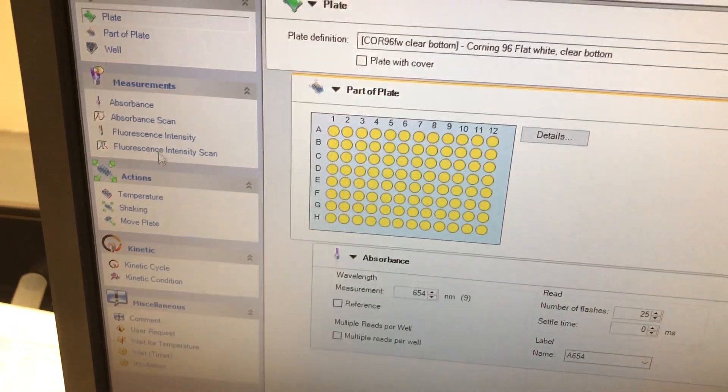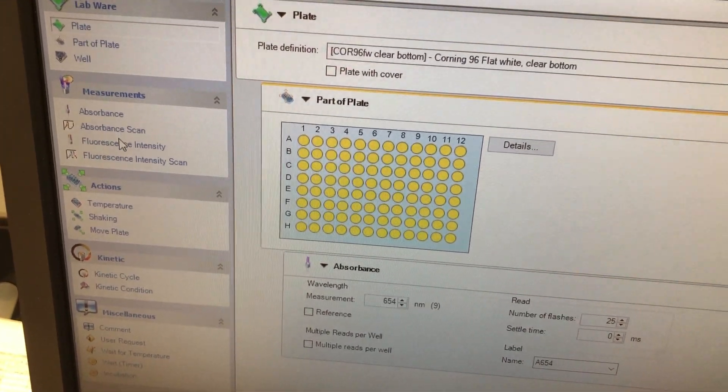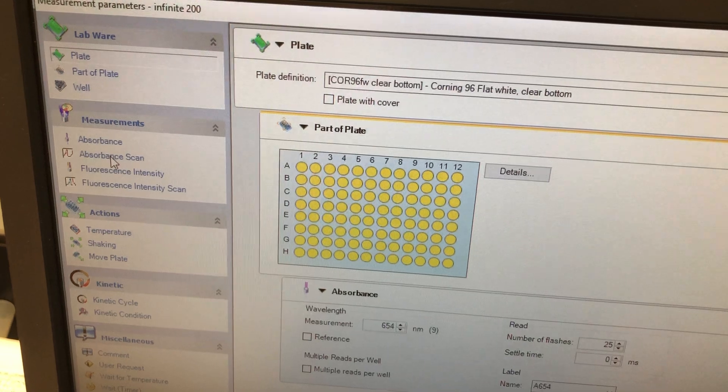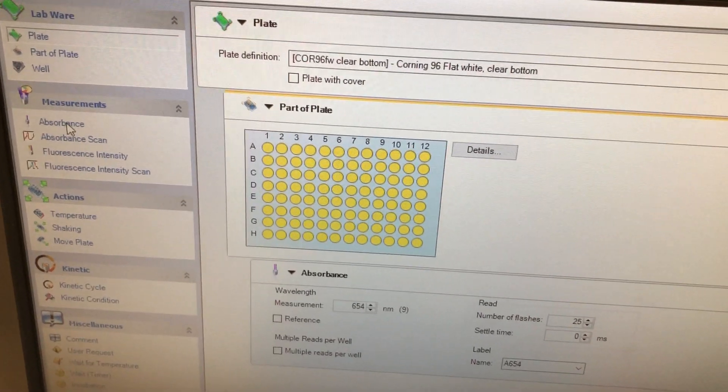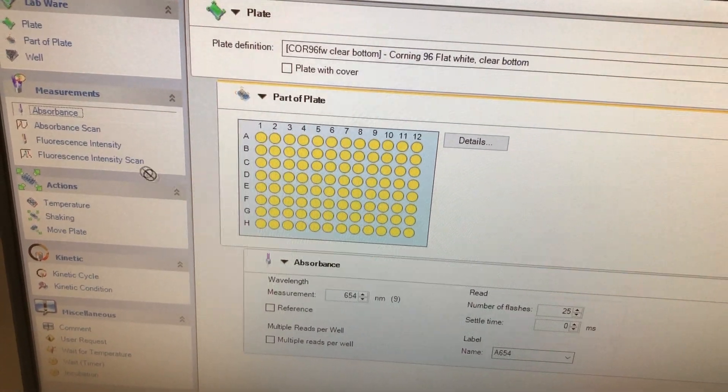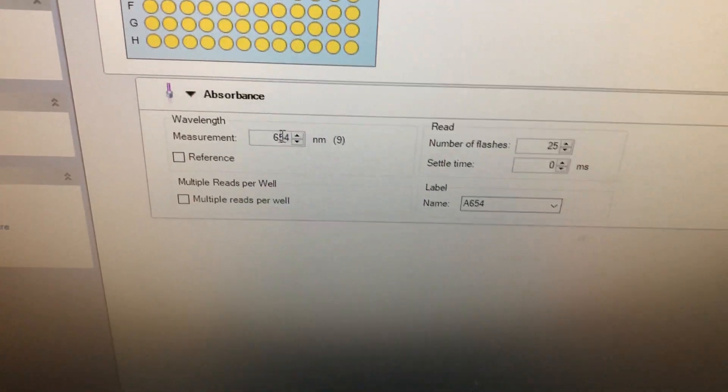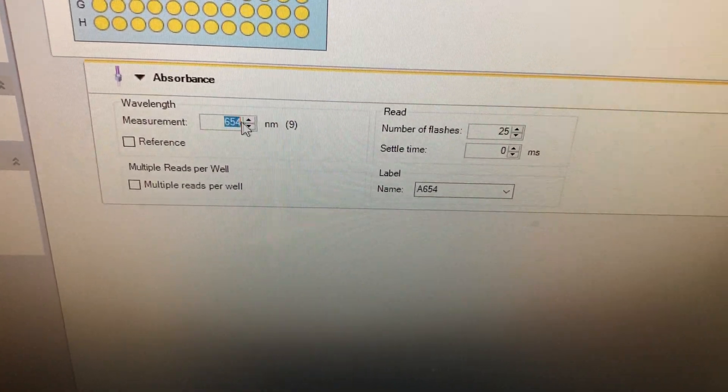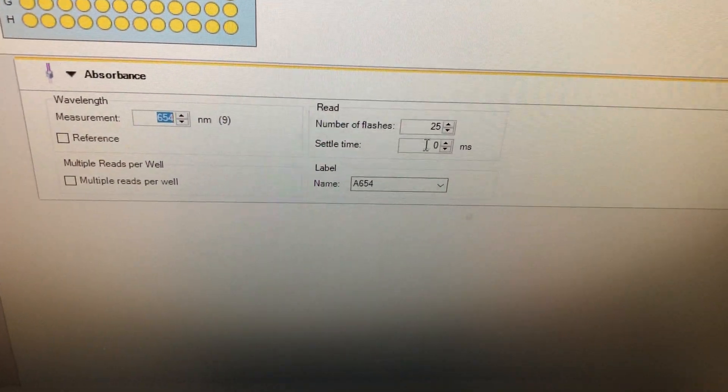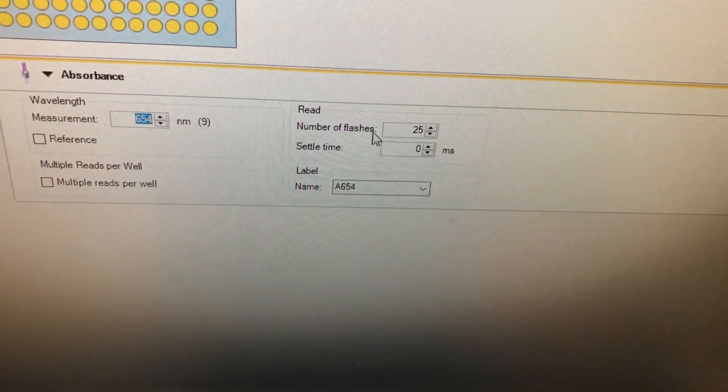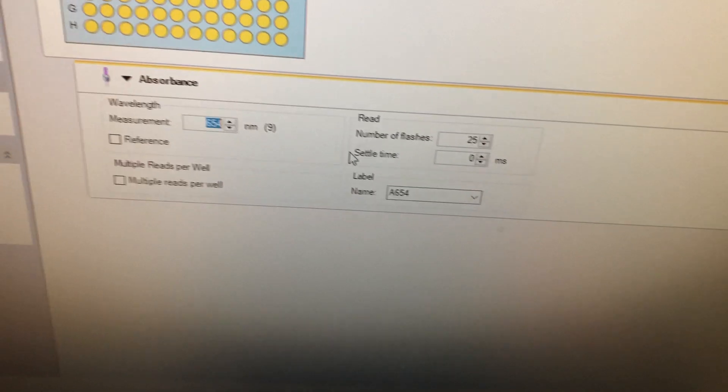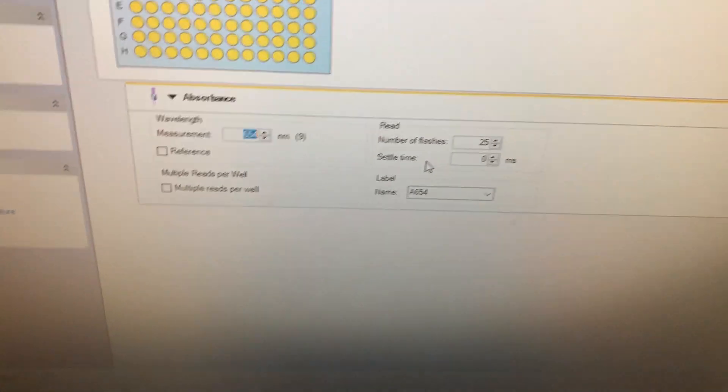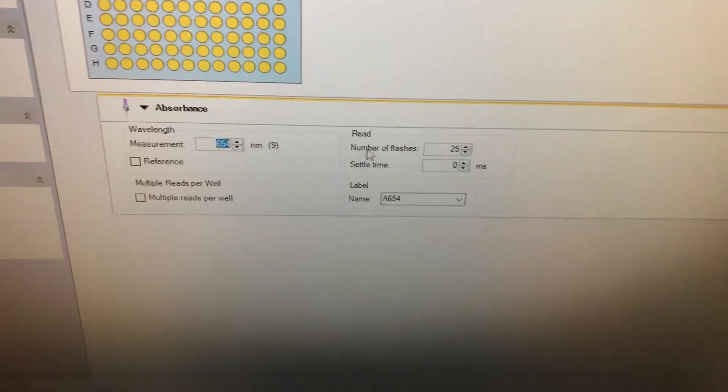And then you can drag and drop over absorbance, fluorescence, whatever you want to do. Just scan across all the absorbance values or if you just want to take a single absorbance value. Again, you just kind of drag and drop that. We've already got one dropped over here. And then you just type in the wavelength of the absorbance that you want to measure. I typically just leave these kind of flashes and settle time to the default settings. It seems to work well. I've played with these parameters and haven't seen much of a change in the read values when I've done that.